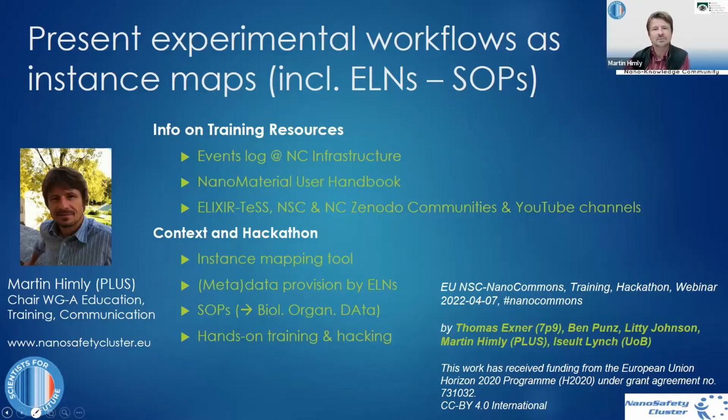And I would like to welcome everybody to this current session on present experimental workflows, how they can be connected, for example via instance maps, to electronic laboratory notebooks where the data and eventually also protocols are located and where you can interact with your teams quite cooperatively around the globe.